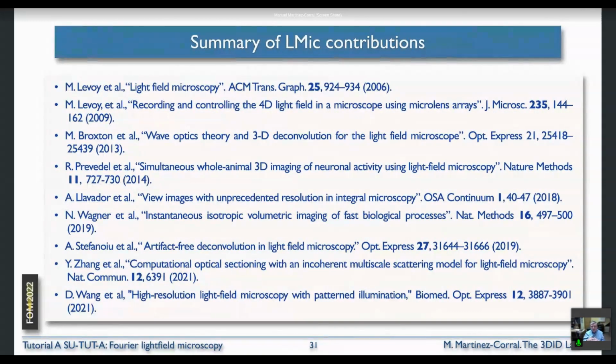So if you want to follow the light field microscopy contributions and progress, you still can, for example, in this summary of contributions I have collected for this course. I would say that mainly in the past few years, everything that is made is computational. Proposals are based on computation.